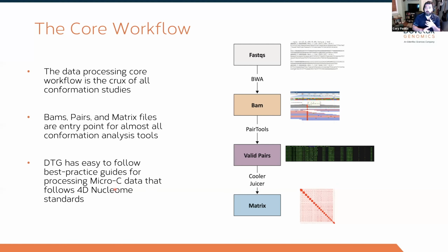So all of the tools like HiChIP Pro or HiChIPper, things like that, Homer, all of those are following this exact same workflow. They just have a whole pipeline built around it. And we found that not using a restriction enzyme kind of breaks a lot of those assumptions. But we'll talk about that a little bit more towards the end.